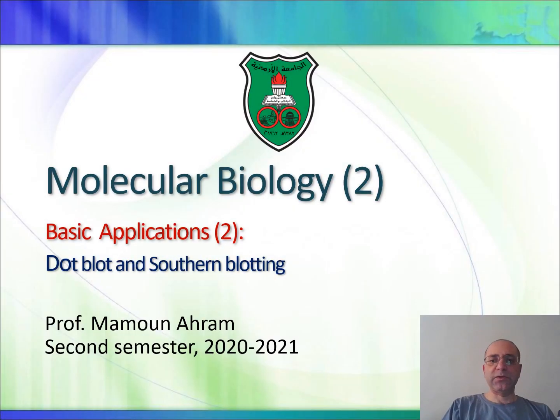Assalamu alaikum. So in this lecture, we'll talk about two techniques. These techniques are not used anymore as extensively as before. But if you understand the concept, and that's what I care about, it will help you understand a lot of things in molecular biology. The techniques are known as dot blot and Southern blotting, or dot blotting and Southern blotting, whatever.